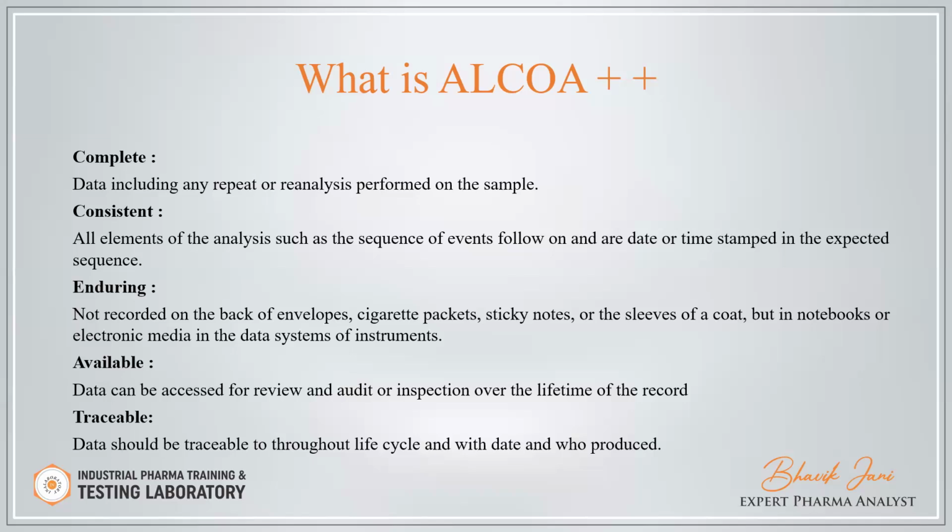Traceable. Data should be traceable throughout the life cycle. Traceable means who prepared, when prepared, why prepared, what prepared. All the W's should be captured in a traceable manner. All the data should be traceable throughout the life cycle. So it's ALCOA plus.